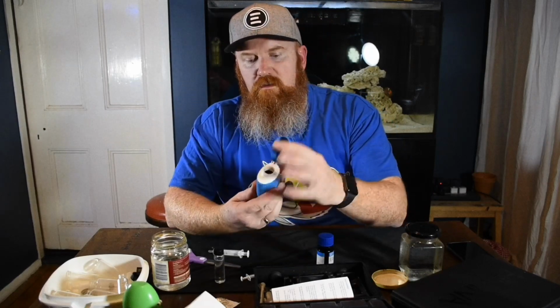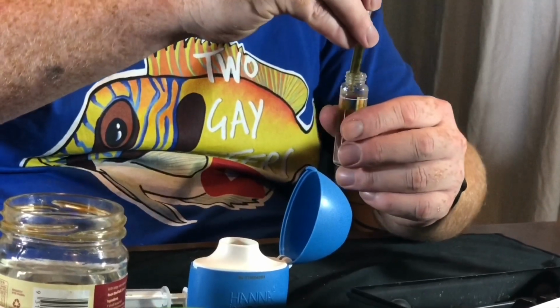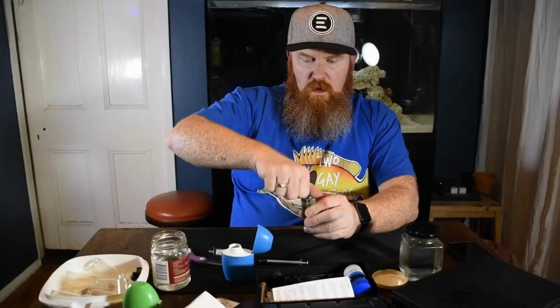Fill it up to the 10 mil mark. Spill a little bit of water on it, so give it a dry. Make sure there's no bubbles in there. There's C1 on the checker, so you put the vial with just the salt water in there, and you're waiting for it to do its thing. Grab your reagent, grab your 1 mil syringe. Now it says C2, so you take out the vial. Put your 1 mil in there. It just says shake it 3 times. Make sure there's no bubbles.